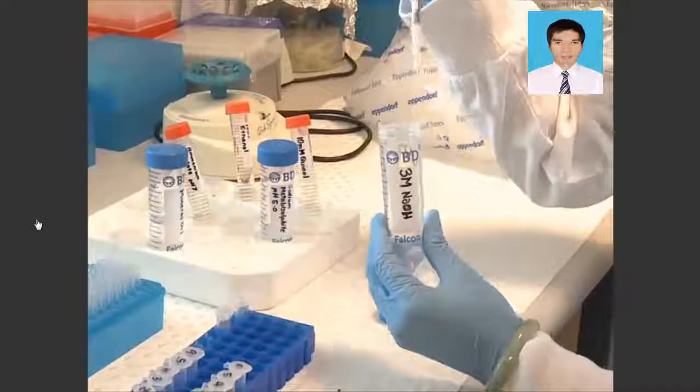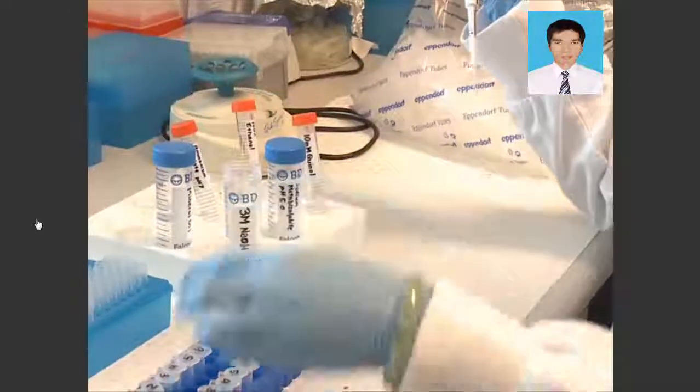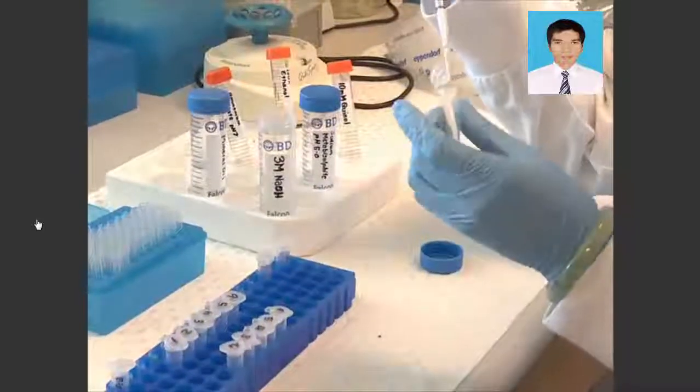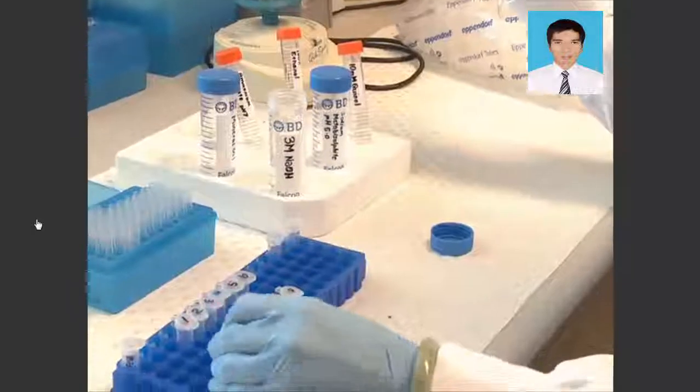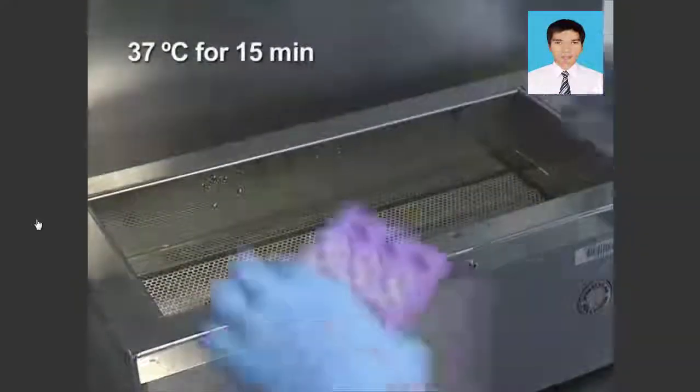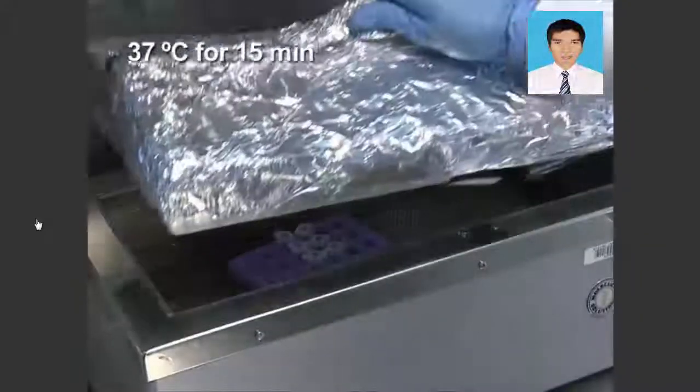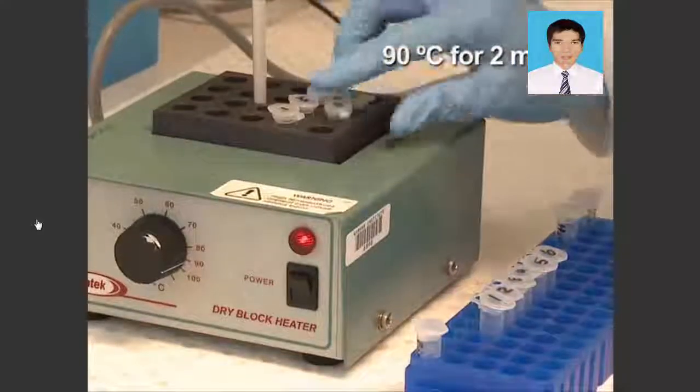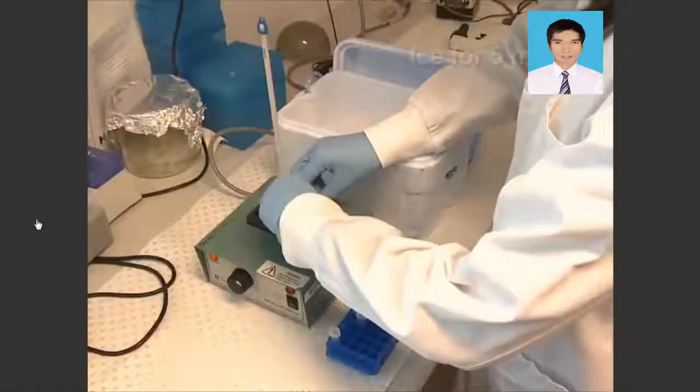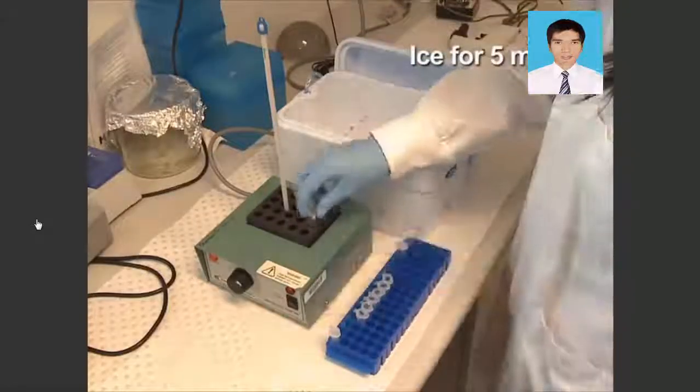Then denature the genomic DNA by adding 2 microliters of freshly prepared 3 molar sodium hydroxide to a final concentration of 0.3 molar. Incubate the samples at 37 degrees Celsius for 15 minutes in a water bath, followed by incubation at 90 degrees Celsius for 2 minutes in a heat block. Immediately place the tubes on ice for 5 minutes.